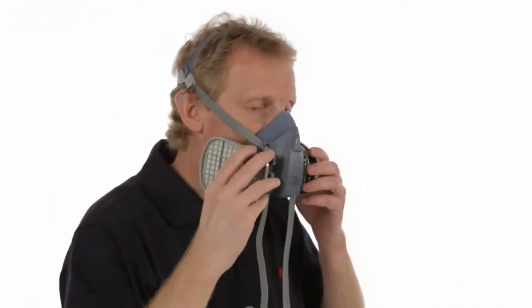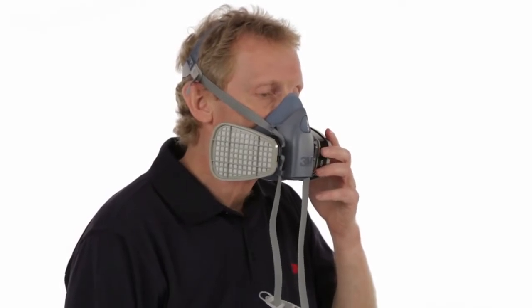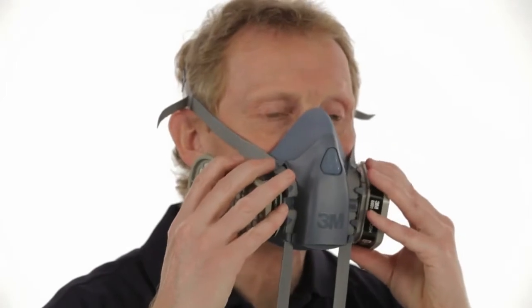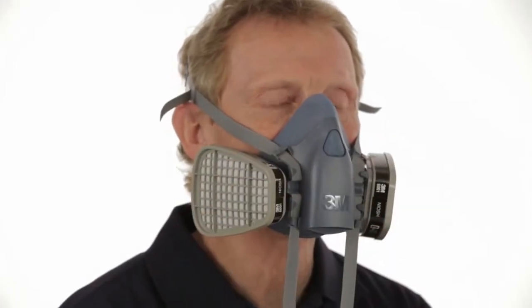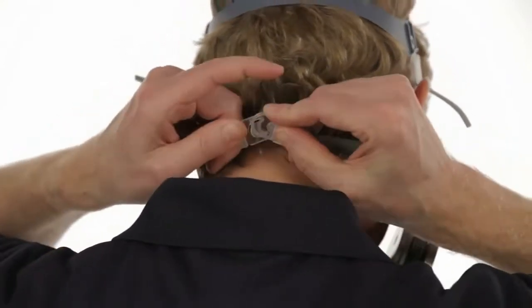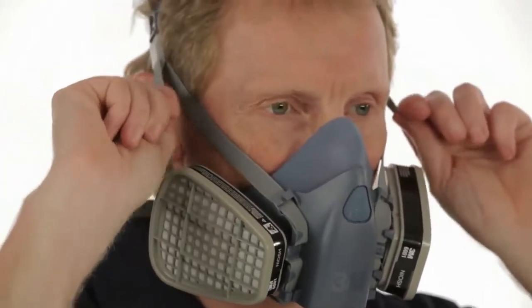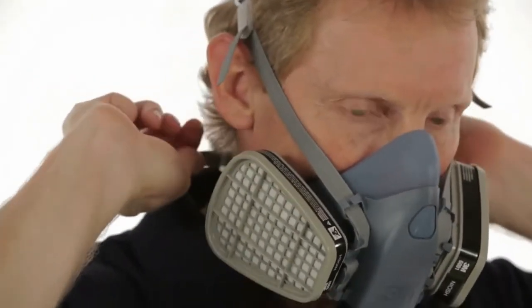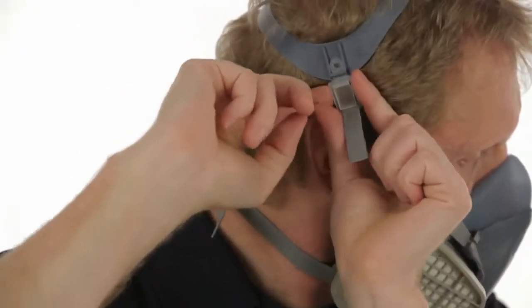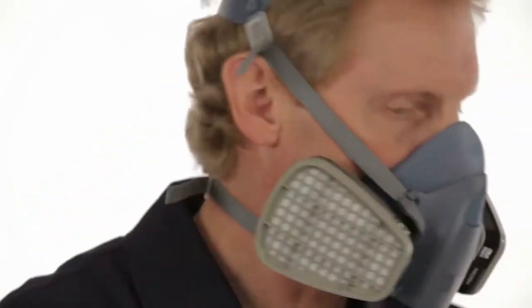Place the respirator over your mouth and nose, then pull the head harness over the crown of your head. Position the facepiece low on the bridge of your nose for the best possible fit and to prevent the respirator from blocking your vision. Take the bottom straps in both hands and hook them together behind your neck. Tighten the straps by pulling on the ends, top straps first, then the bottom, until the respirator fits securely but comfortably. Do not over-tighten. If the straps are too tight, push out on the back of the buckles to loosen them.